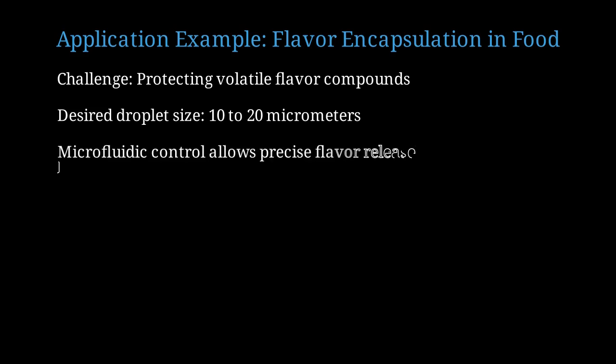With microfluidic generation, we can precisely control the droplet size, and therefore, the flavor release kinetics. All droplets release their contents at the same rate, giving consistent sensory experience. The release time is proportional to diameter squared divided by the diffusion coefficient. So even small variations in diameter lead to large variations in release time. Monodispersity is crucial.